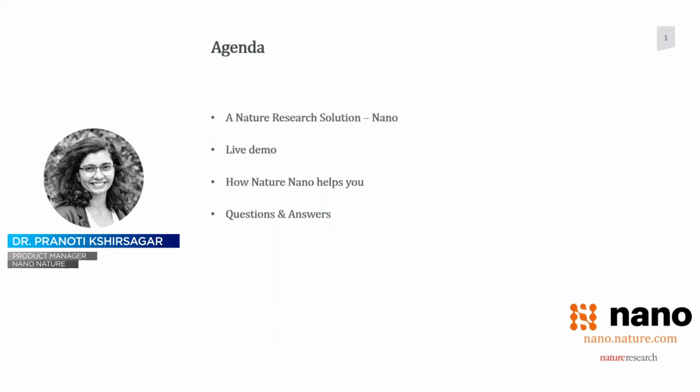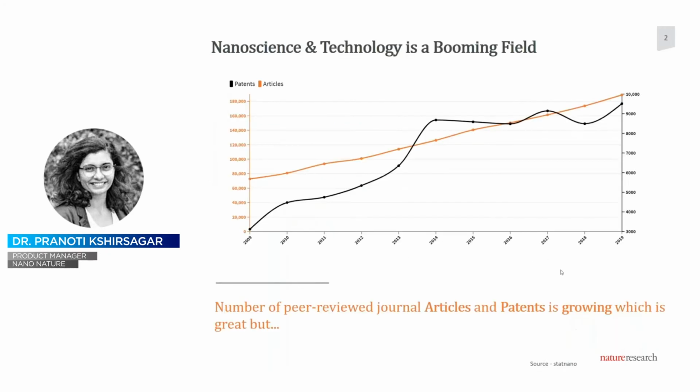I will give you some examples and use cases of how you can use the platform. We'll then summarize how Nature Nano helps you in detail. And then we'll get to your questions. So feel free to keep writing your questions in the questions box. Steve is keeping a very close eye on the questions box, and we'll try to cover as many of your queries as possible. All right, without further ado, let's begin with the idea behind the Nature Nano database.